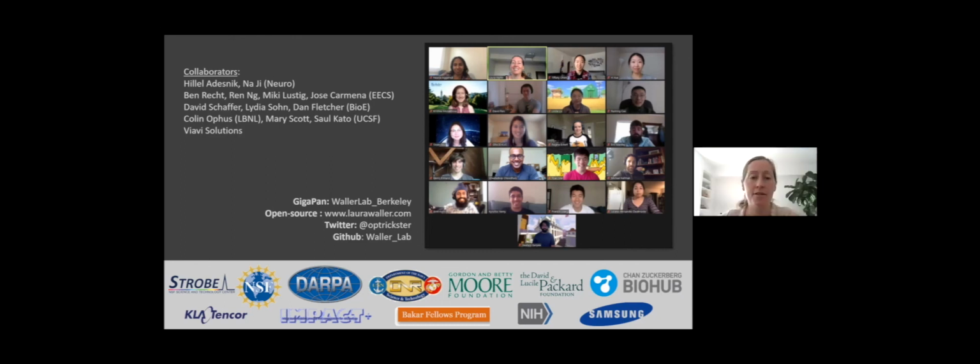I don't know if we have the most computationally efficient way, but it's pretty simple to think about. If you have the 3D refractive index profile, and then say you have a 2D fluorescent image down here, it's going to be warped by passing through this 3D refractive index profile. So one really easy way is to just backward propagate the output light to the image plane that you care about, and then that's your final result. It should automatically undo all of the scattering effects. There's probably better ways to do this depending on if you have just a few sparse fluorophores versus a 2D image under a 3D refractive index chunk. We're just getting started with this, so I'm not sure if there's better ways.